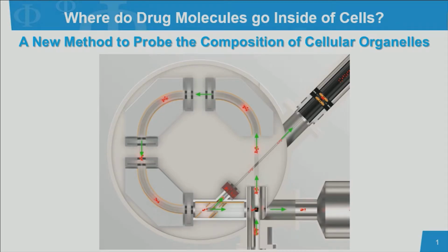Welcome and good morning. In mass spectrometry imaging, increasingly we are being asked to identify where within a cell a compound is located. Historically we've been able to look at single cells with TOF-SIMS imaging, and we can see compounds inside the cell, but people want to know which specific organelles these compounds are located in. In particular, people are looking for drugs, drug metabolites, things like that.